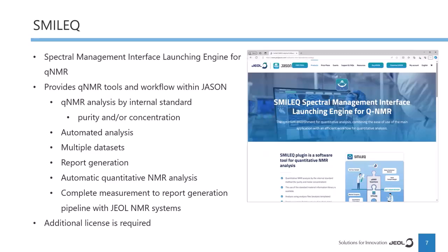Okay, so I'm going to spend the rest of the presentation now talking about SMILEQ. So like all good NMR spectroscopists, we have to have an acronym. So SMILEQ is the Spectral Management Interface Launching Engine for qNMR. Basically, all this means is that we've packaged all of the tools that you need to analyze your qNMR data into the plugin, and once you activate the plugin, it allows you to perform these analyses.